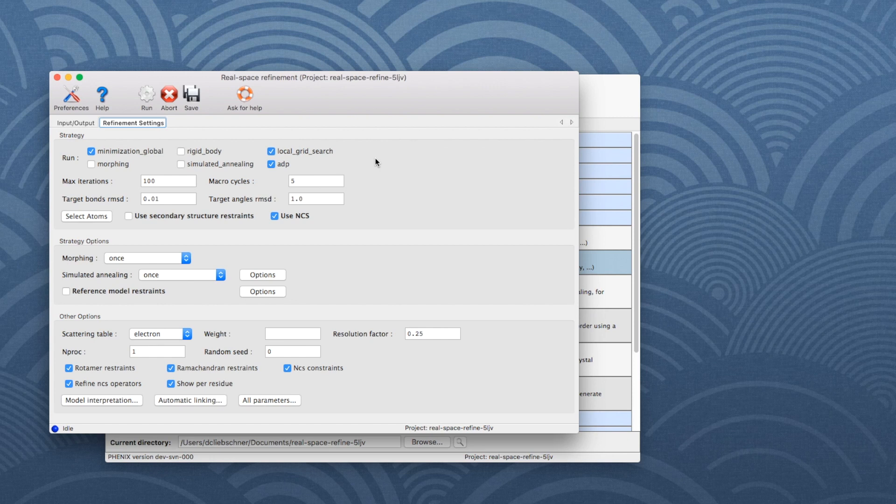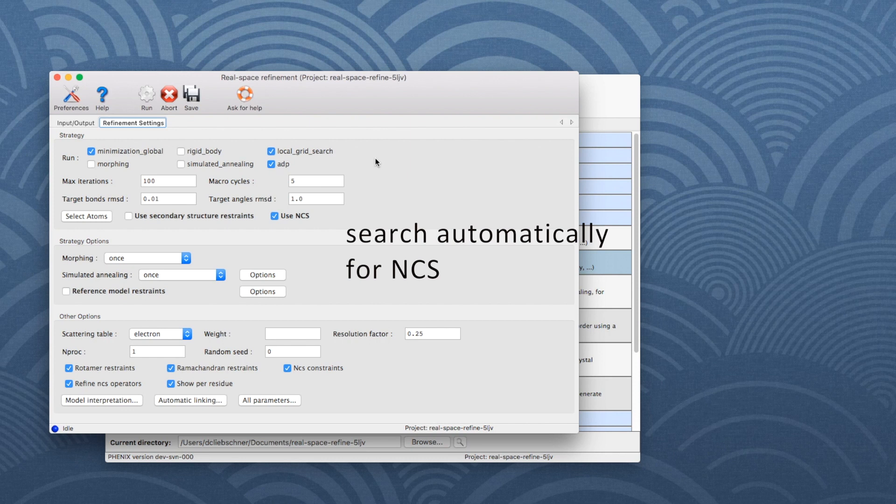Furthermore, the tool will automatically search for NCS, and if present, it will attempt to determine NCS groups and use them to define NCS constraints.